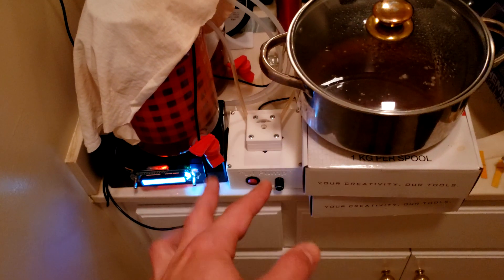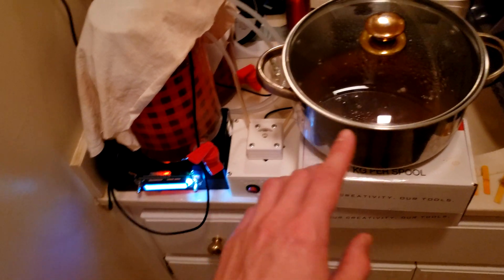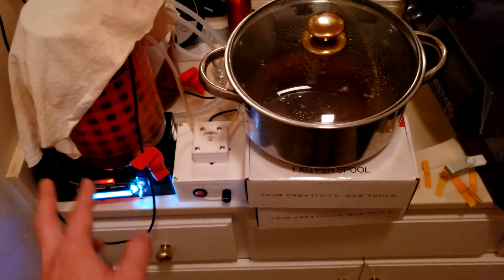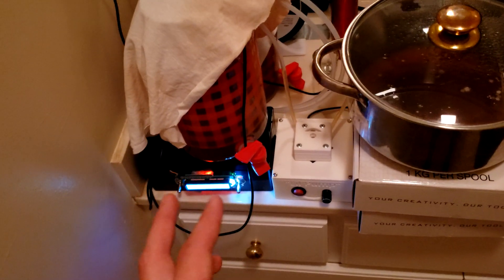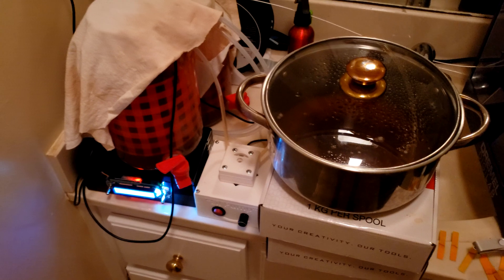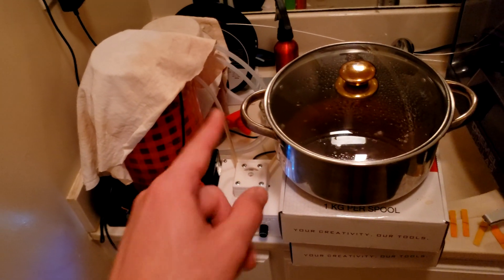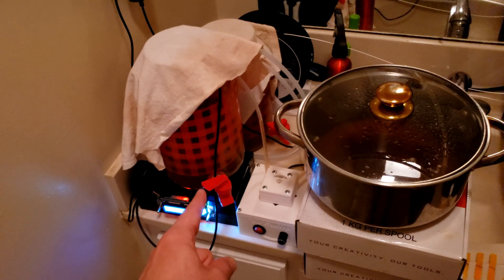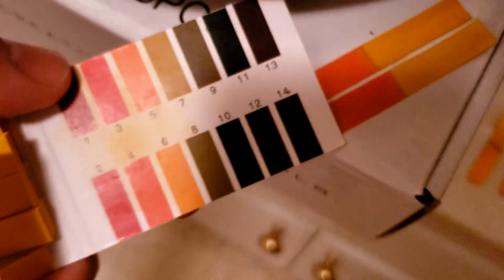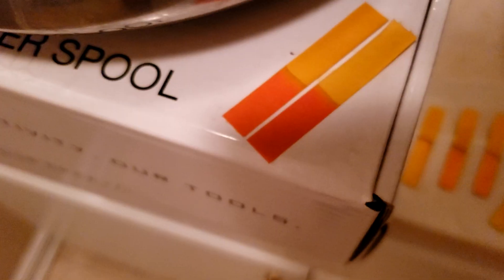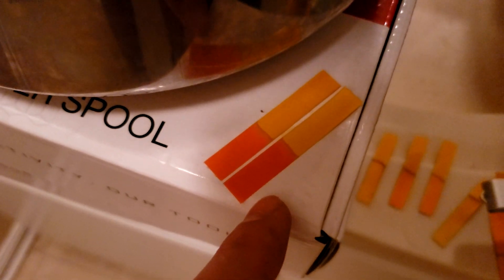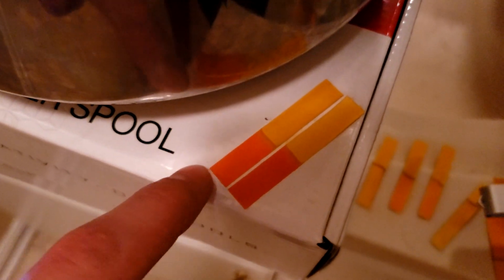So the setup works pretty well. It's been about four or five days now. And I would come in here and turn on the peristaltic pump for 15 to 30 minutes, twice or three times a day. And I think it went really well. So let's check the pH of both the batch fermentation in the back and then the fed batch in the front. Okay. So here are the results. And you can see that the pH is probably a four. And you probably can't tell which one is which. This one right here is the batch fermentation. And this one right here is the fed batch fermentation.